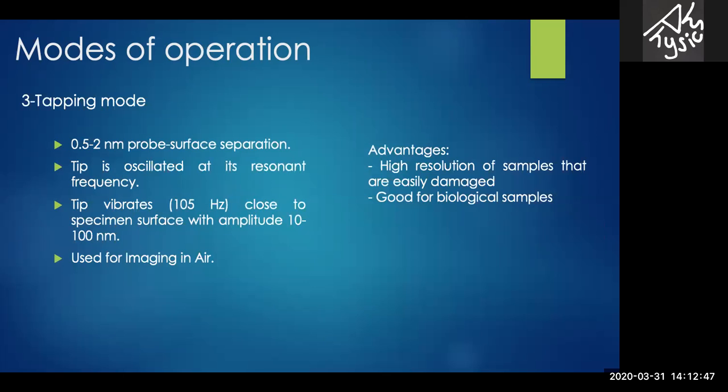The third mode of operation is called the tapping mode. It has a 0.5 to 2 nanometers probe-surface separation. The distance between the probe and the sample should be between 0.5 to 2 nanometers.